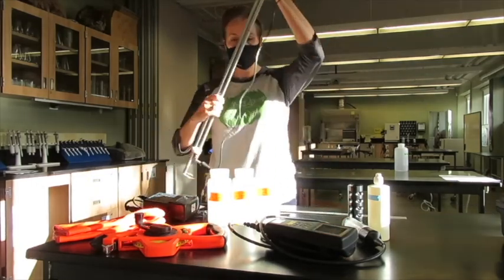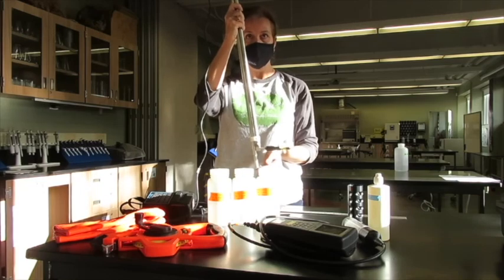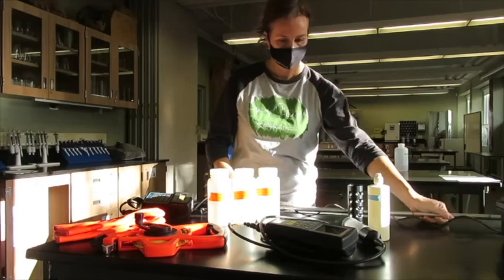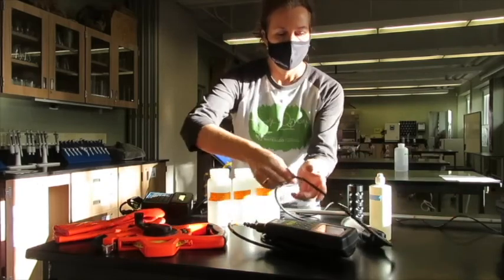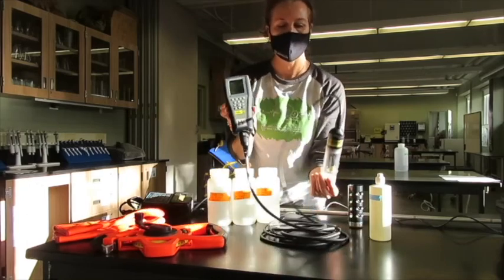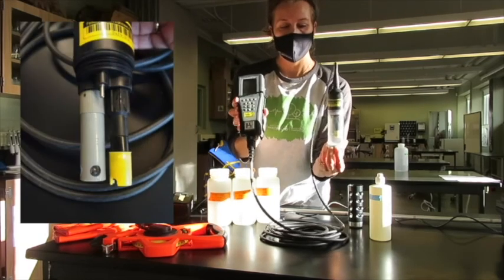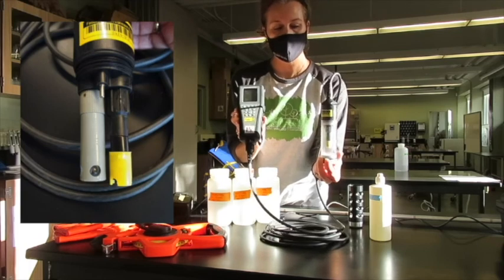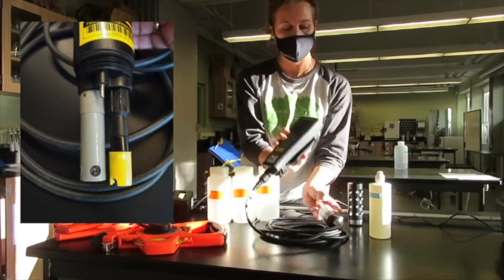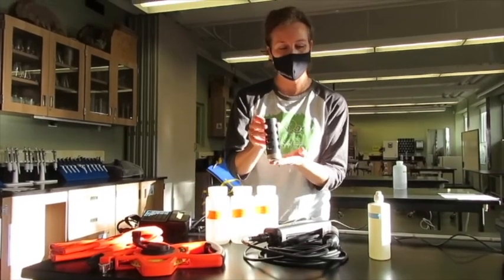Here is the wading rod and we've already attached it. Note the propeller attached to the rod. We have a YSI ProPlus multimeter with various probes attached. We have the capacity to test for water temperature, pH, dissolved oxygen, and conductivity.